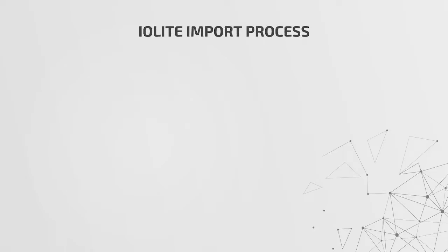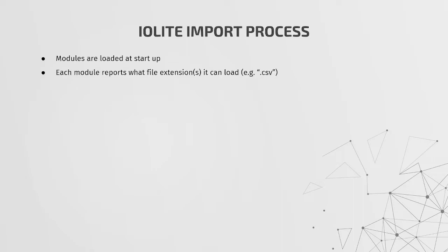Now let's have a look at what happens when the user wants to import some data. First of all, the modules are loaded at startup. Each module reports which file extensions it can load. Can this custom importer that we've written load CSV files? Can it load .txt files? And so on and so forth. It tells Iolite what sort of files it can load.